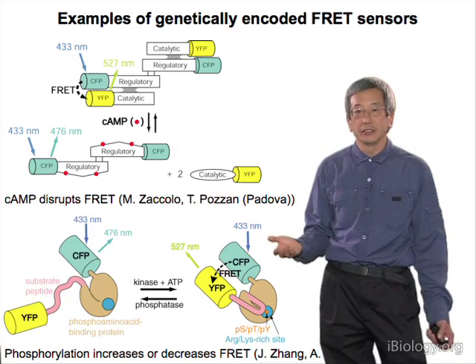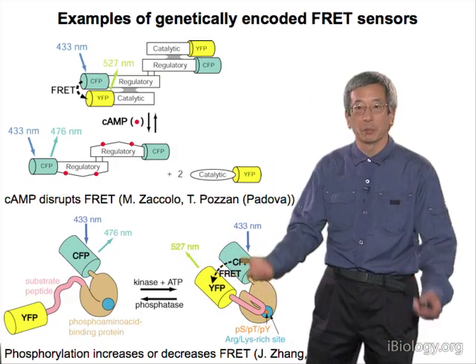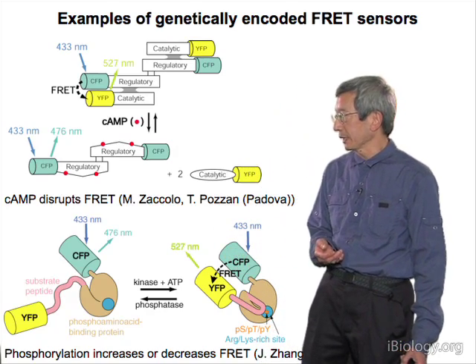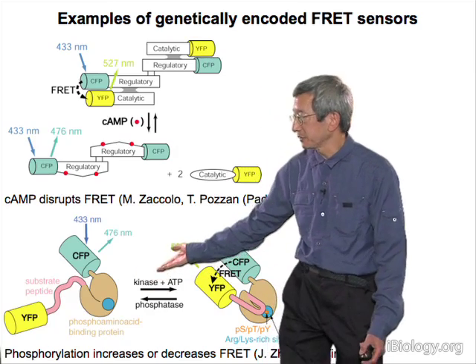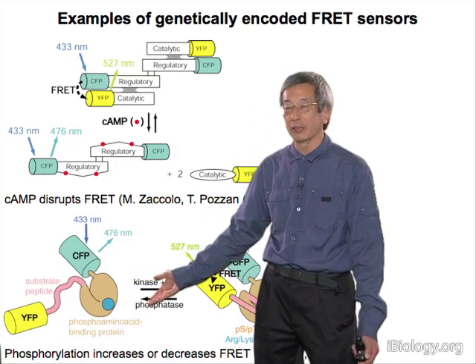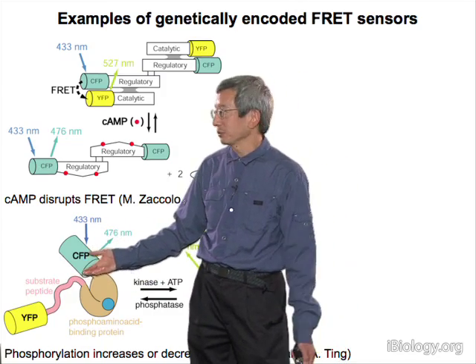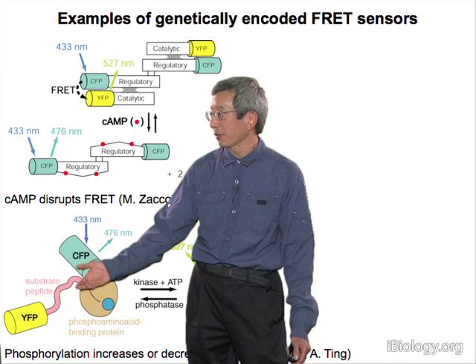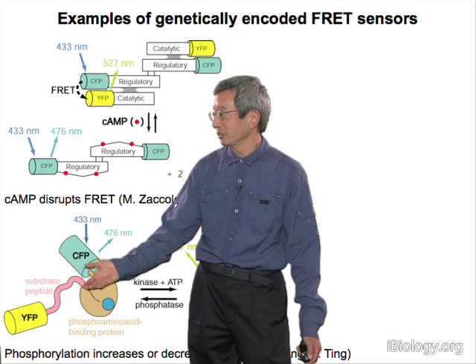How can we see not just cyclic AMP, but the action of any protein kinase? As you know, protein kinases are amongst the most ubiquitous and universal and important of all signaling mechanisms. And here we exploit the fact that there are certain known motifs that like to bind phosphorylated amino acids, but won't bind the original amino acid before it got phosphorylated. So now this is a variant of the calcium sensor. Now the pink bit is the floppy peptide that's in the driver's seat. It's not M13 anymore. It's a substrate that the kinase wants to phosphorylate if the kinase is active.